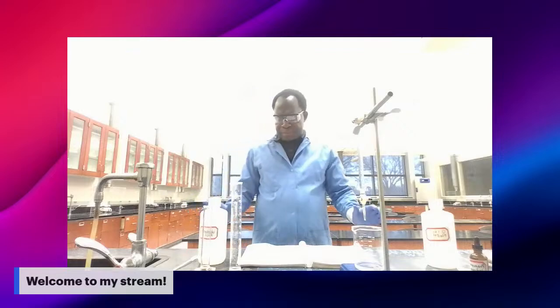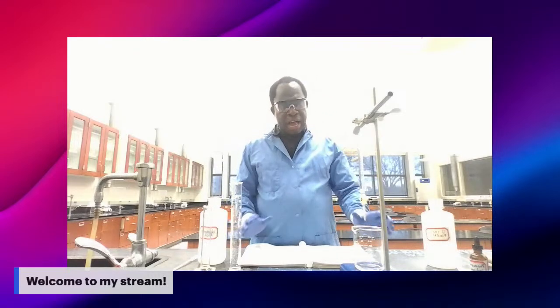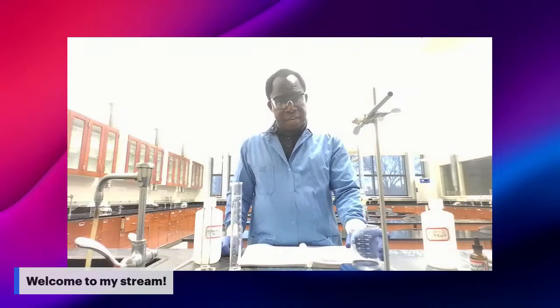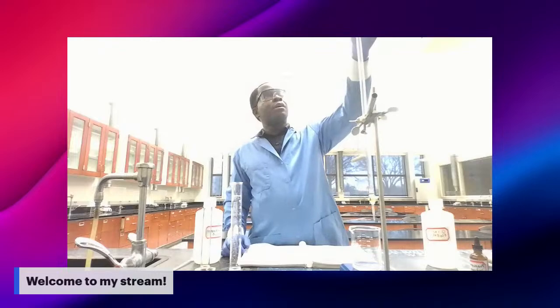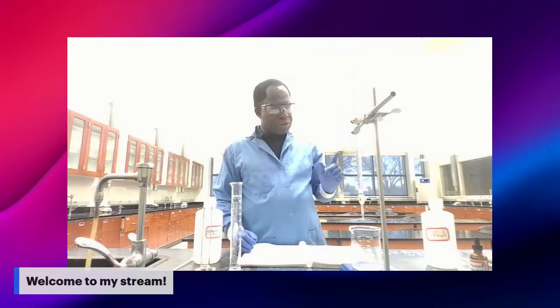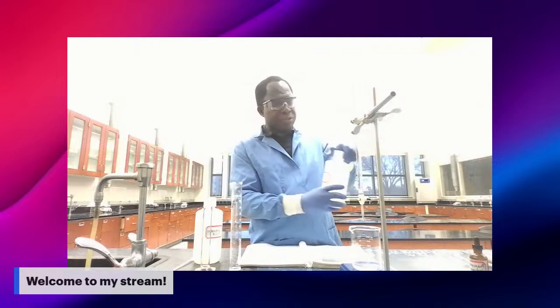Now part three is where you're going to perform the titration. But before you perform the titration, you already have your unknown acid ready. Now you need to fill up the burette with the strong base you are going to use for the lab. We are using 0.1 molar sodium hydroxide.